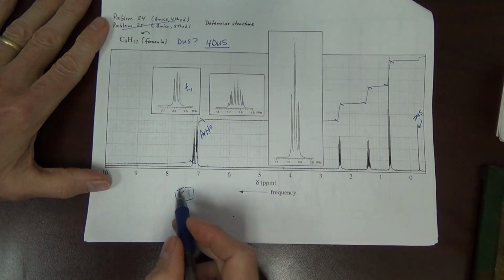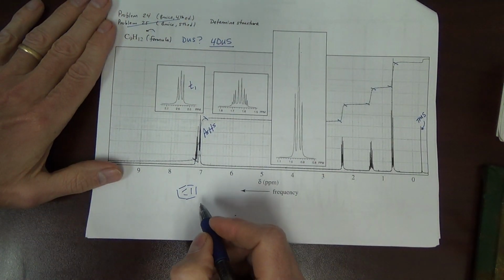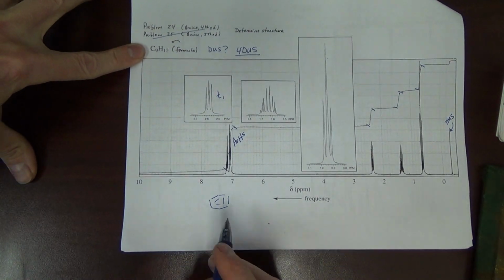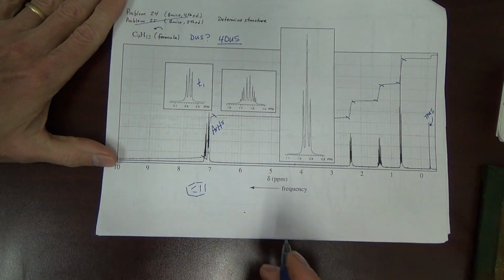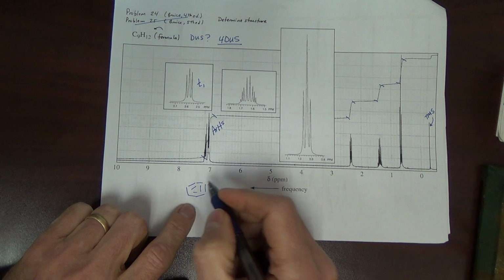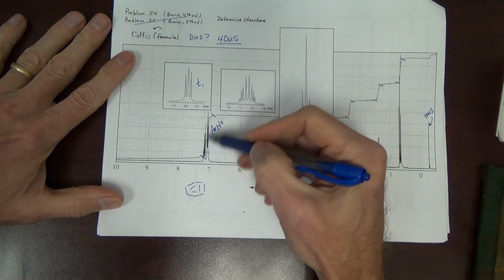Okay. Now there has to be substituents on the benzene. If it was just benzene, it would only have peaks here. By the way, the formula has 9 carbons. If it's a benzene compound, there's 6 carbons right there, and we only need to show 3 more to complete the structure. Now, one question at this point becomes, how many H's are on the benzene ring? There has to be less than 6 because one of these carbons has to have a substituent, at least one. But how many? Well, number of H's. That comes from your integration.